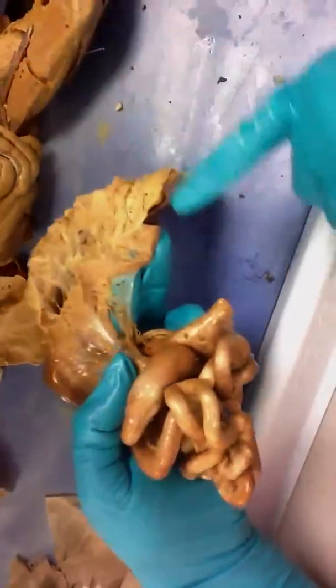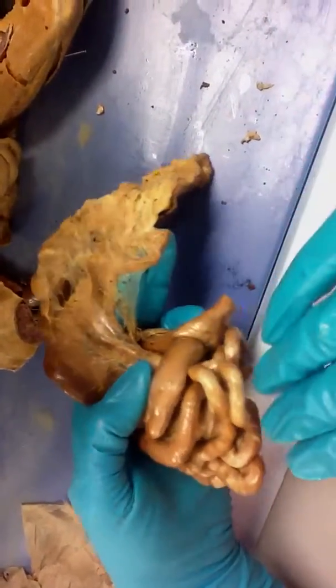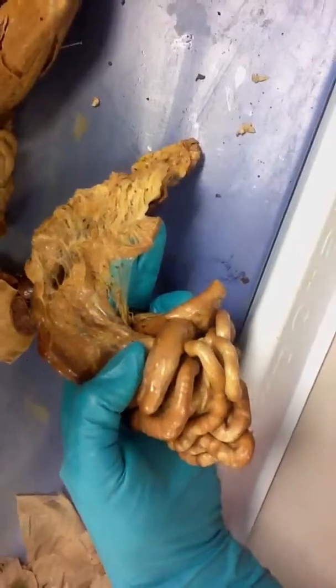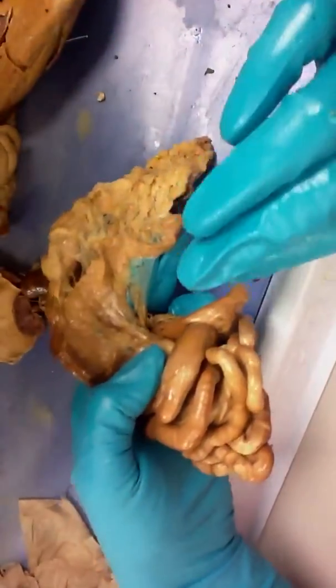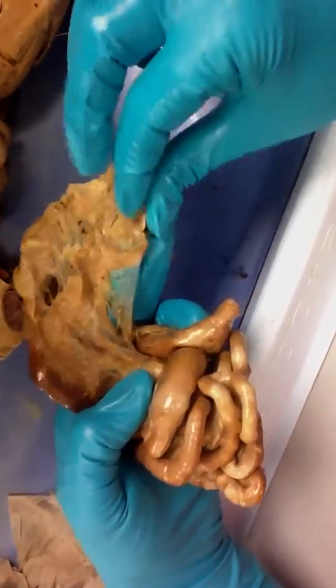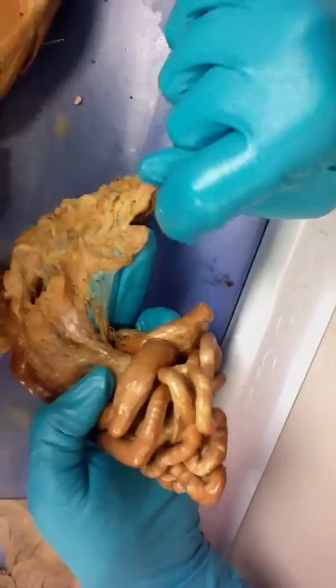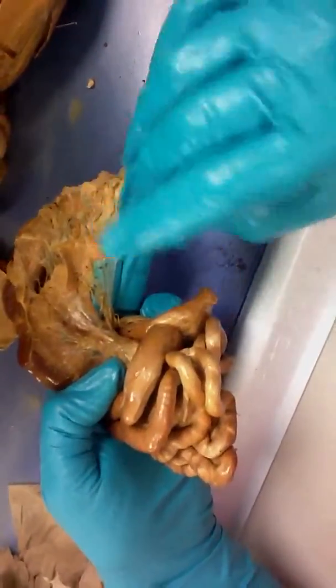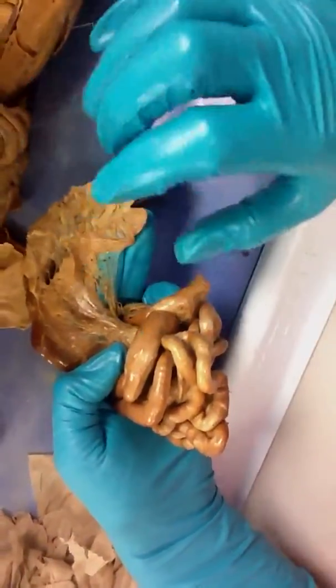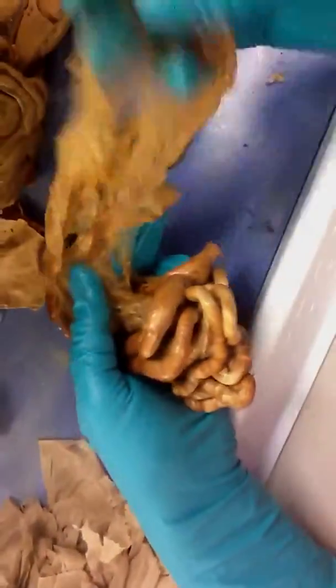Okay? Pancreas is a very fragile organ. If you do any sort of abdominal surgery, it is very friable. If you touch it too much, it gets angry and inflamed, and it's very easy in a living animal to destroy the tissue. And our pancreas is important because it produces a lot of our digestive enzymes, glucagon, insulin, all those important biochemical enzymes. This is the greater omentum.